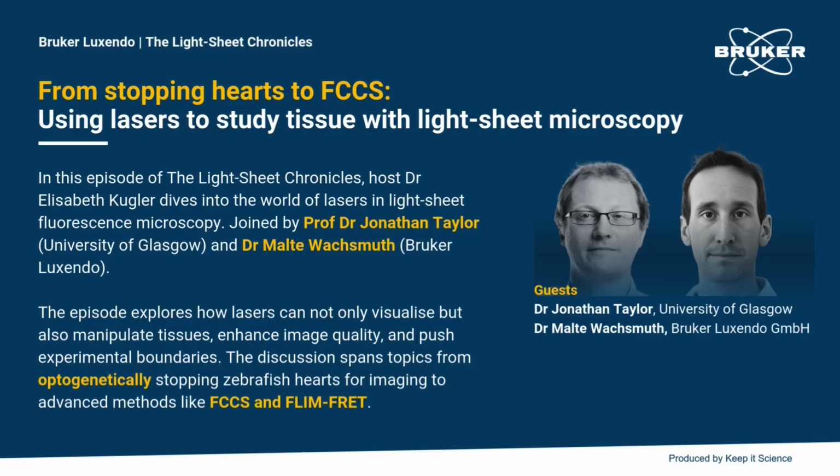And to overcome this, there are different strategies to mitigate this. One would be to illuminate not only from one side, but also to illuminate your sample from opposing directions, from the left side and from the right side, so that you can basically recover the signal in areas where the light from the other side casts a shadow.